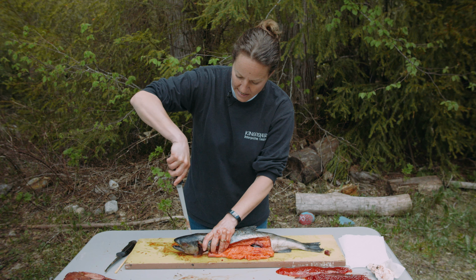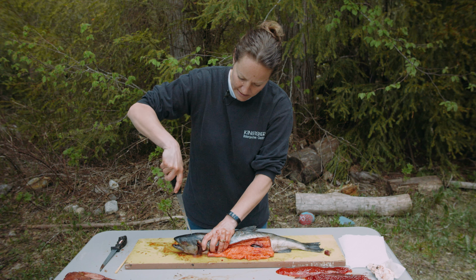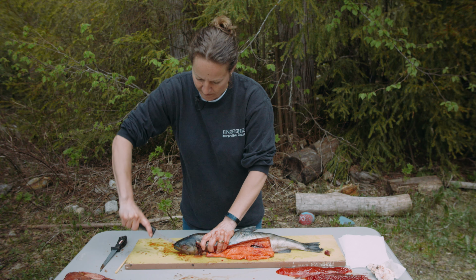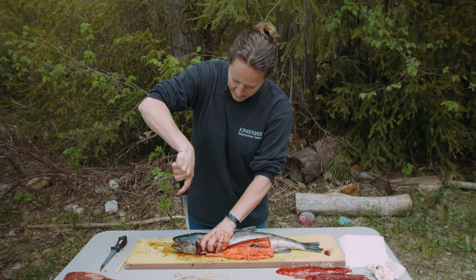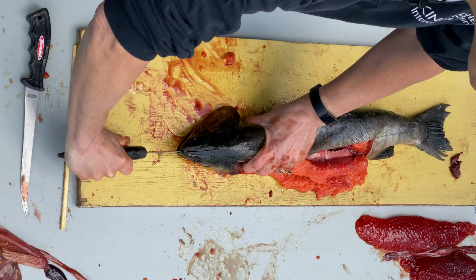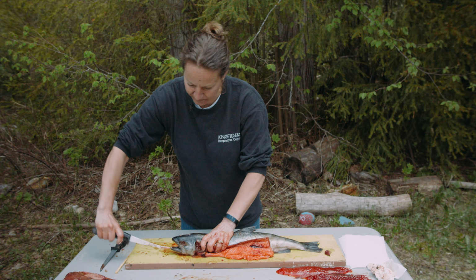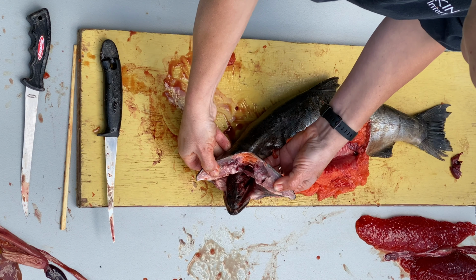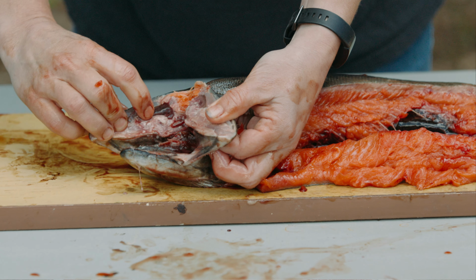So I'm going to have to cut into it right here. Oh, let's try the other knife. So we'll cut the head open and we'll have a look at the brain. So this part might be a little gross for you, boys and girls. Okay, now I'm going to open it up. Oh, and the brain is this white part right here.